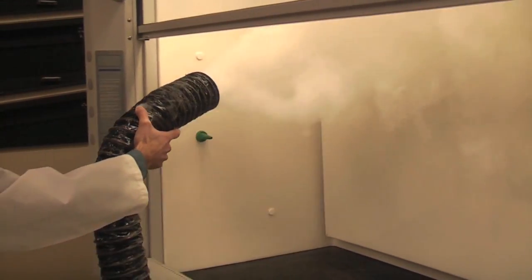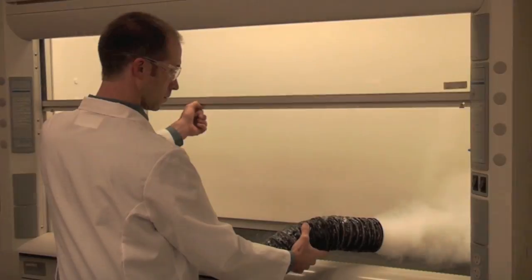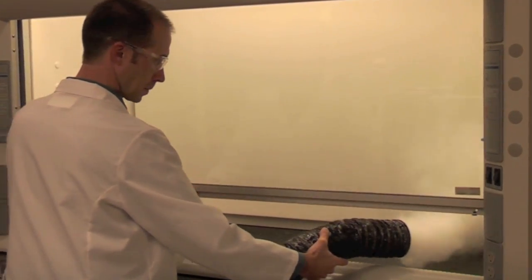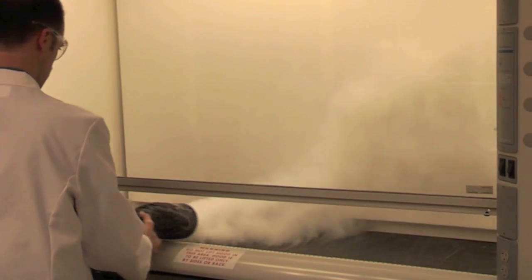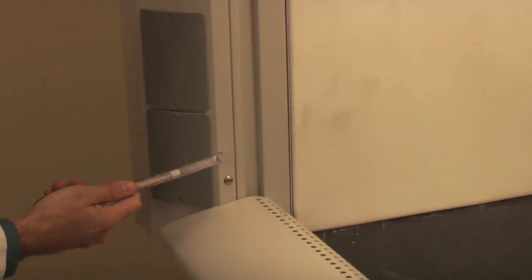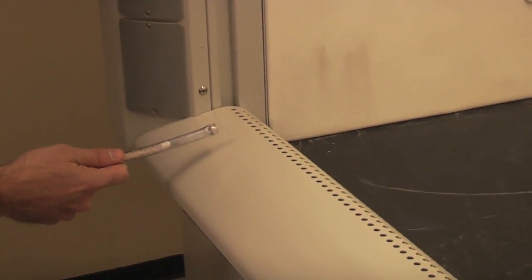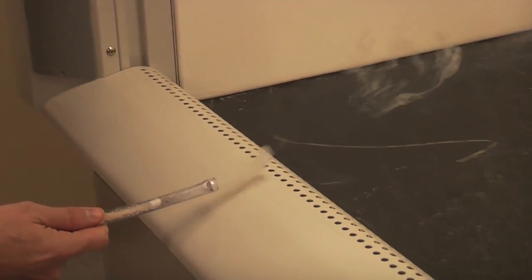The ASHRAE test is comprised of multiple parts. First, titanium tetrachloride or theatrical smoke is used to check for reverse air flow along the sash foil, as well as along the walls and work surface of the hood. Light smoke is also generated to detect more subtle air movement.